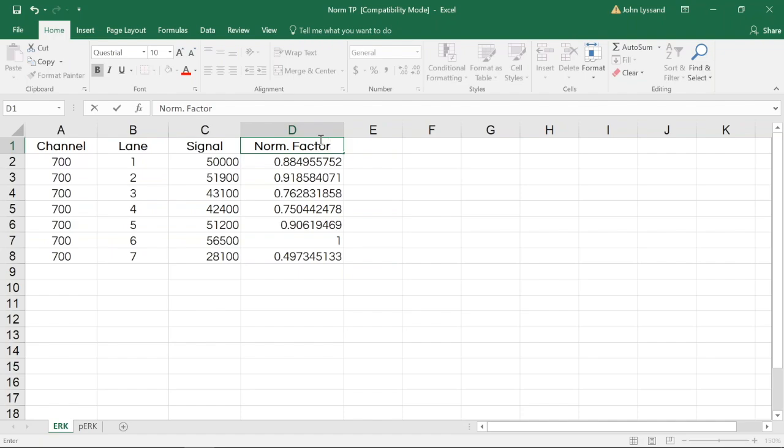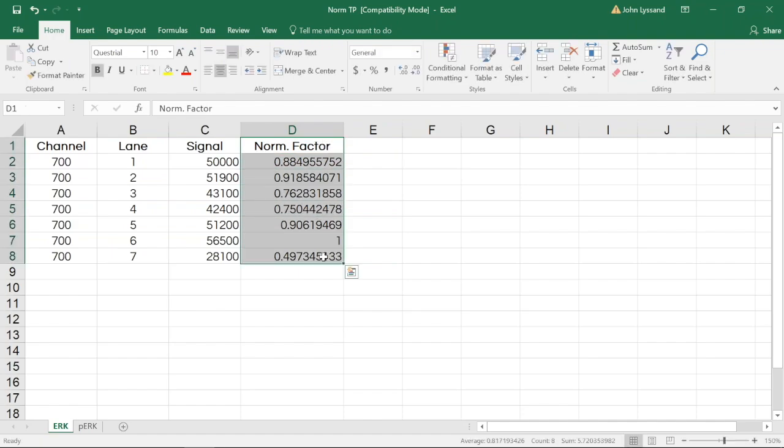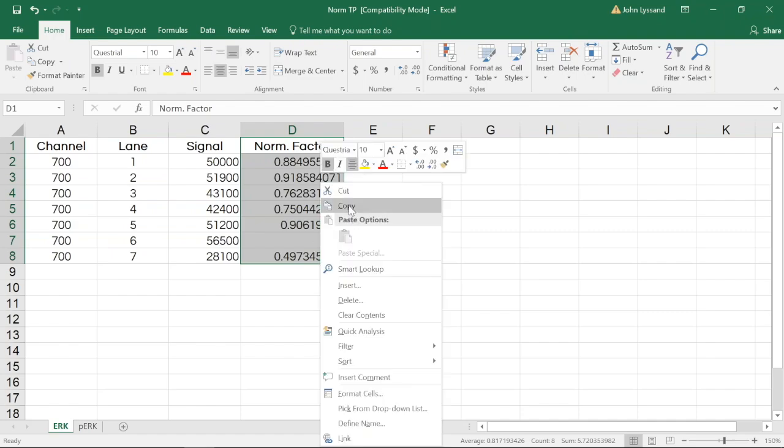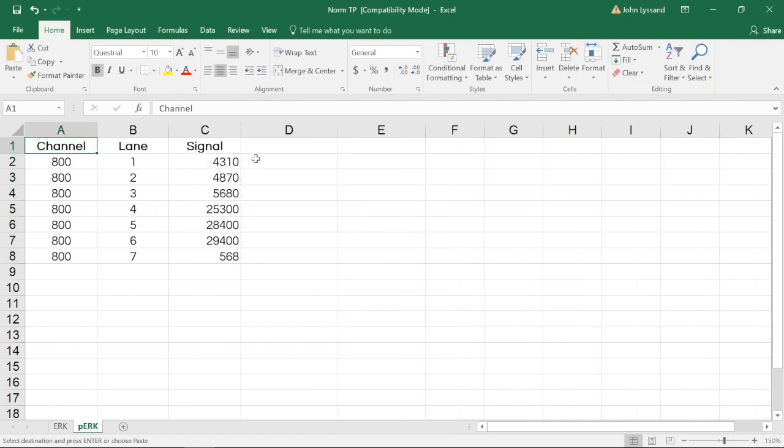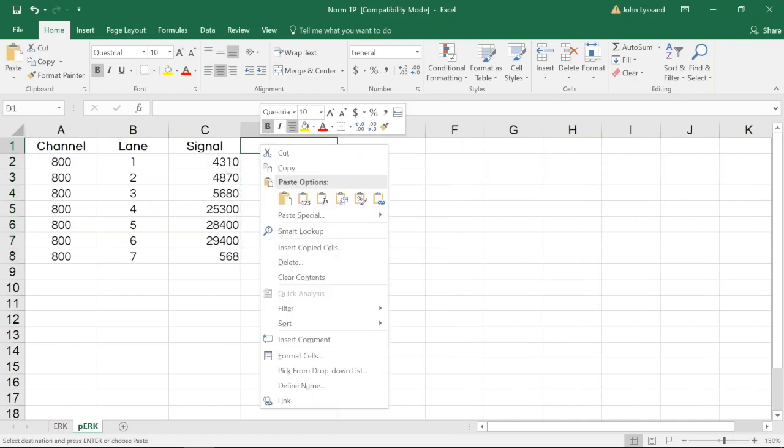Now that we have this value, we can copy this whole data and then go into our phospho-ERK table and paste the values there.